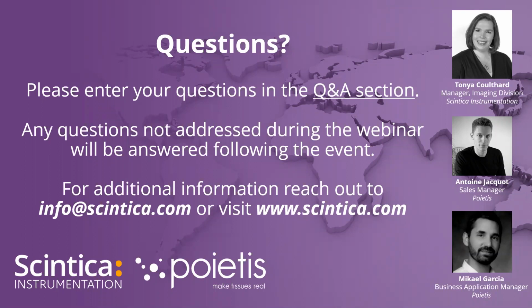Perfect. And so for spheroids and organoids, you'd have the ability to have a larger number of cells to be able to create such structures, yeah? Yes, and you can control precisely the quantity of cells. That's why, in the example that I presented before, we got spheroids with really good precision regarding the size, with the same size, with really good homogeneity.